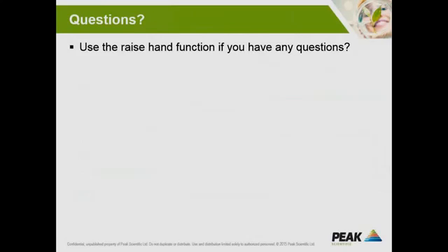I hope that answers your question, Mr. Narasimha. I've just unmuted you. Would you like to add anything? The question is, even if using generators, is a gas purification panel also required? So in terms of a panel of traps? I guess that's what he means.